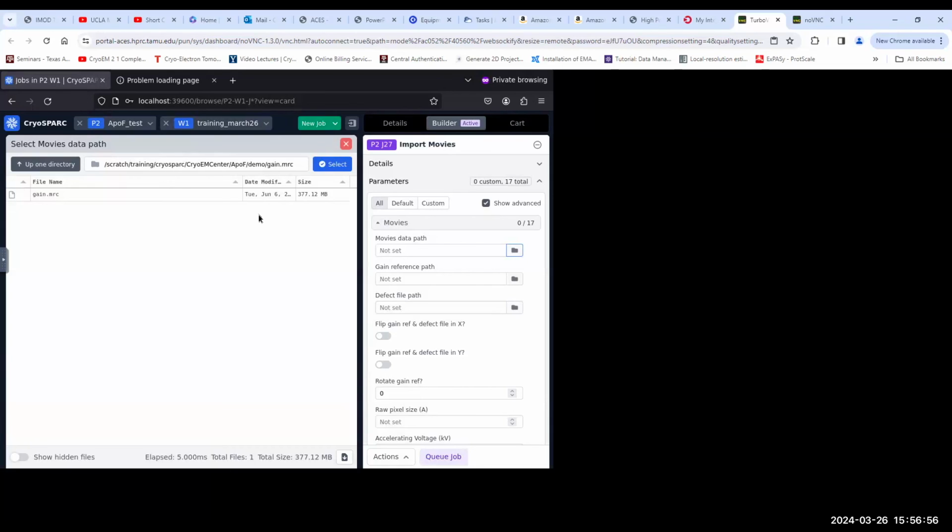That's one thing. Another thing, you can bin it. I did binning 2-3 times, right? Because your particles are large, you can bin 8 times, 10 times. Make them really, really small. And then once you sort out the bad ones, you unbin and process the unbinned data at the last step, to go back to high resolution information.